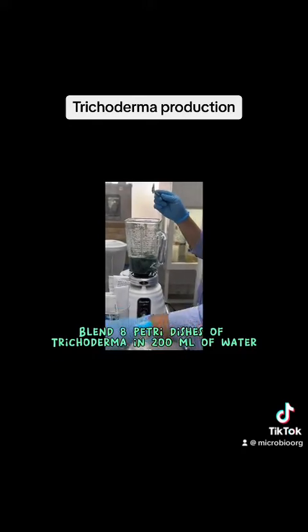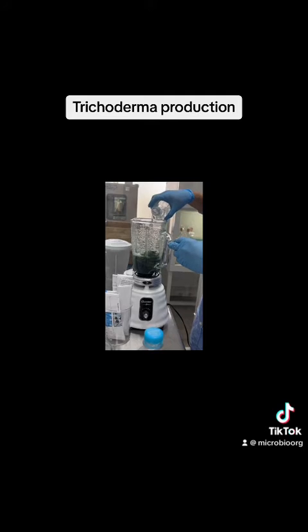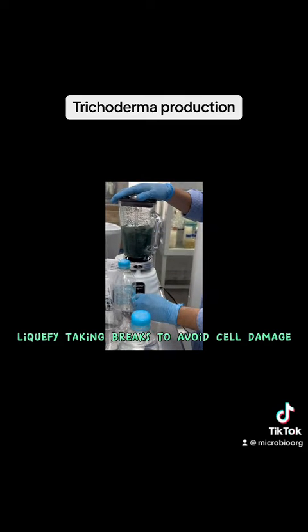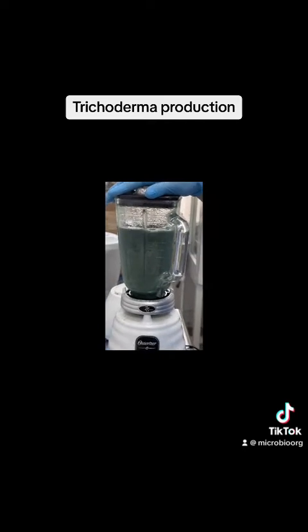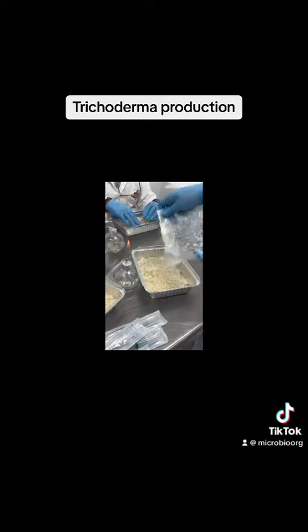Blend 8 petri dishes of Trichoderma in 200 milliliters of water, liquefying and taking breaks to avoid cell damage. The inoculum must have at least 1×10⁸ colony forming units per milliliter to inoculate the rice.